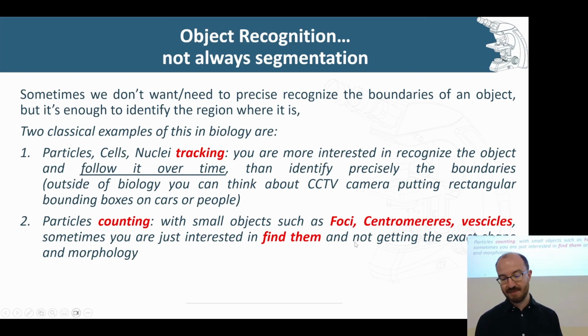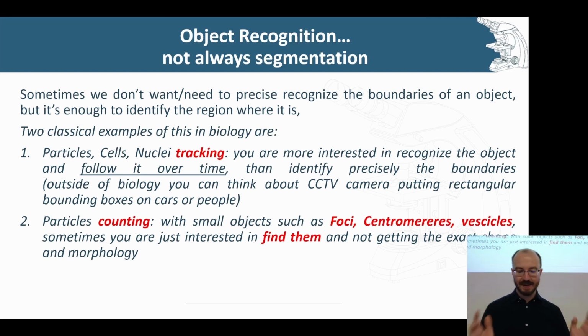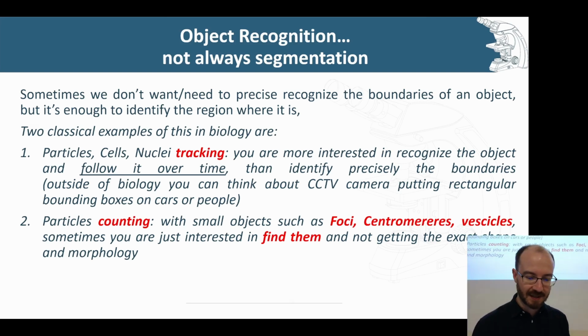And then once you've found them, you can decide what you want to do. Do you want to do this region growing thing where you expand your region to select the entire structure for segmentation purposes, or however you want to approach it? But yeah, we're just talking about counting at the moment.